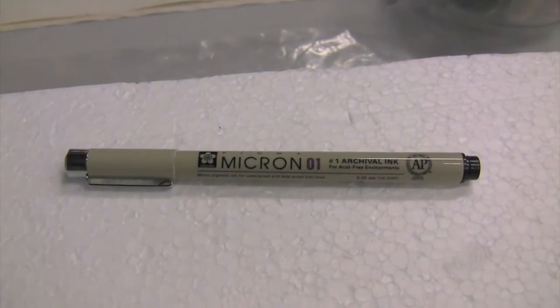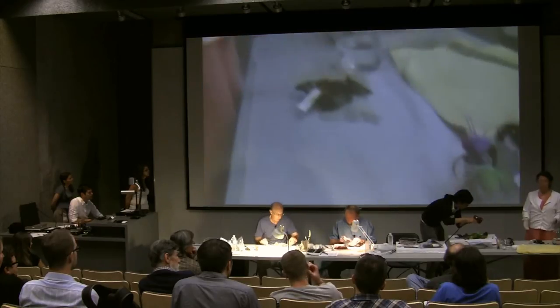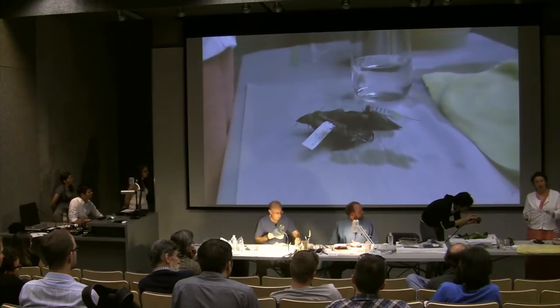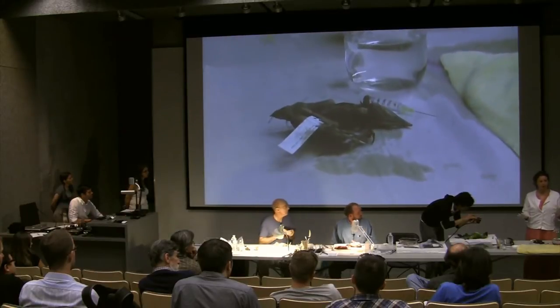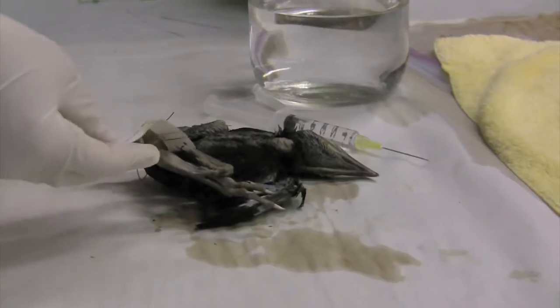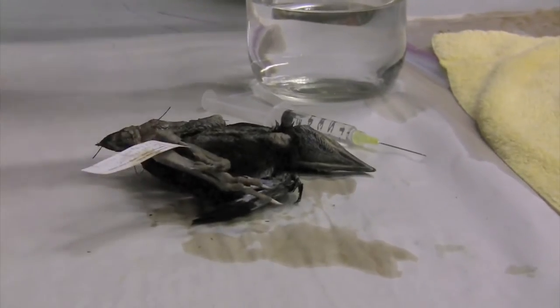But with a pickle, by the time you get to this point, you're just minutes away from being done. So we assign the official final catalog number prior to pickling it, and we write that on the tag so that it goes in there and we are done.